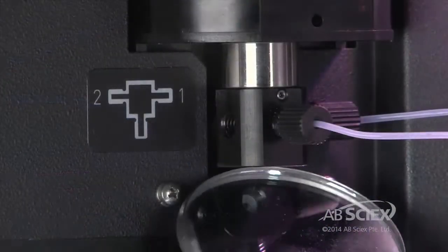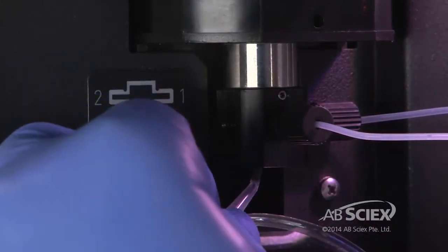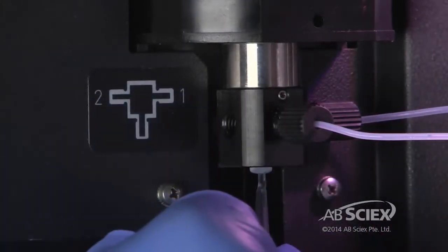Inside the syringe valve, use a plastic pipette tip to carefully remove the white Teflon seal. Be careful not to damage the syringe valve.